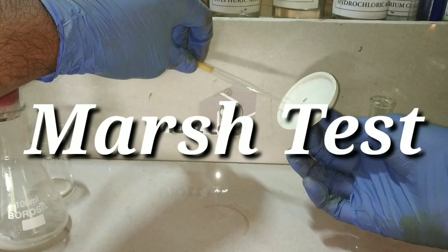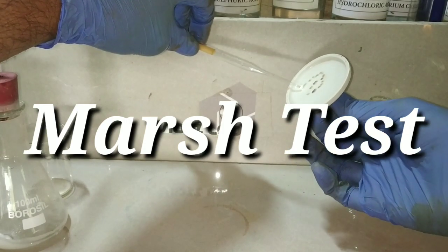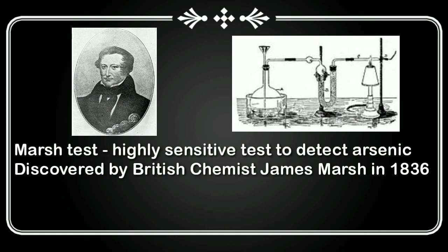In this video we will be performing the Marsh test, which is used to detect the presence of arsenic in a given compound. Warning: this test uses arsenic compounds which are highly toxic. Always use the right personal protective equipment and do it in a well-ventilated area. If your lab is in a closed space, always do it under a fume hood. This video is shot outside and a very minimal amount of arsenic compounds were used. The byproducts were all converted to insoluble sulfide form and disposed at a nearby biohazard waste collection center.